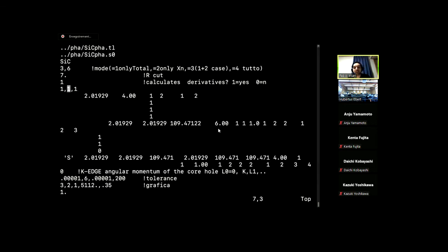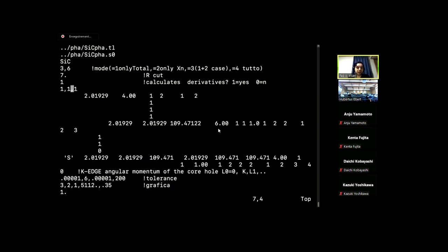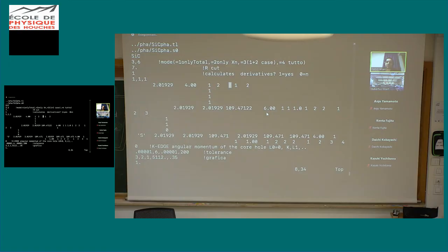This is like a starting point and a finishing point. But in this case, we have only one signal, so all 3 are just 1, 1, 1. Then here is the distance of this two-body configuration, its degeneracy, which is 4, if you remember from before. Then here it tells the program which phase shifts you want to use to calculate this signal.